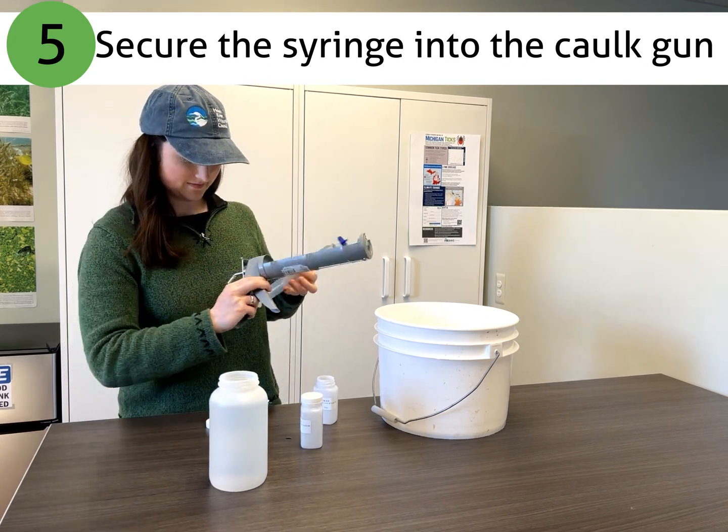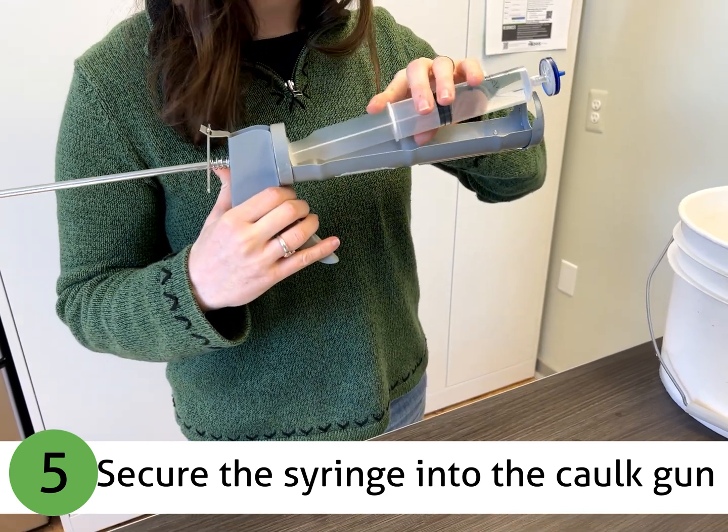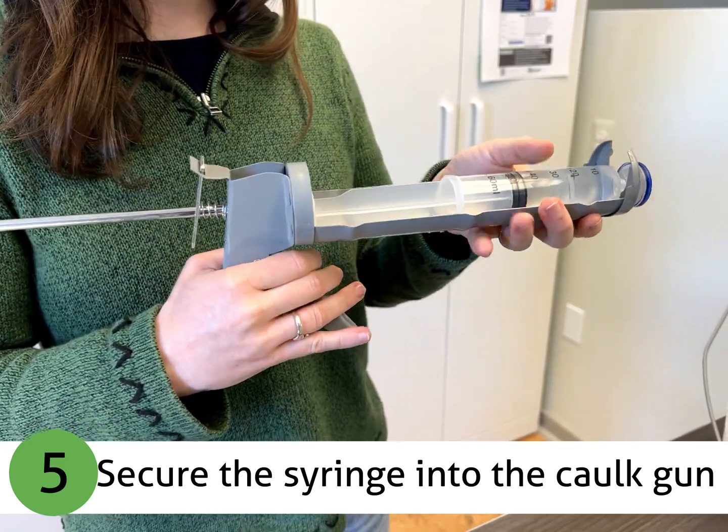Next, secure the syringe into the caulk gun by holding the release plate and pulling back the rod. Align the two plungers and nest the tip of the syringe into the opening of the caulk gun.